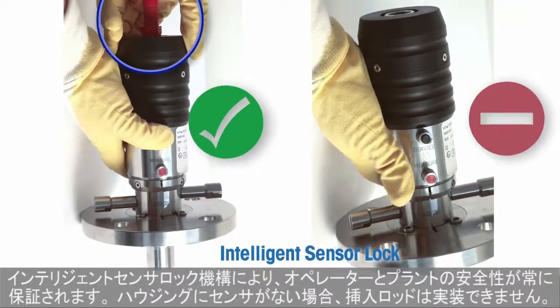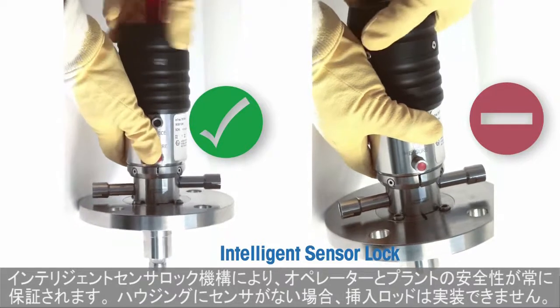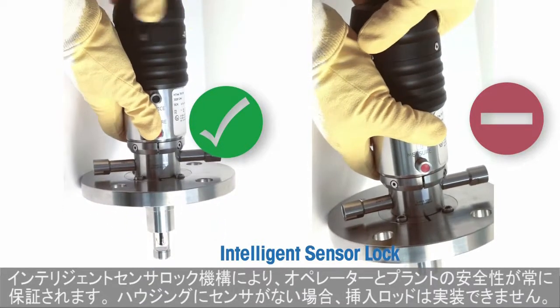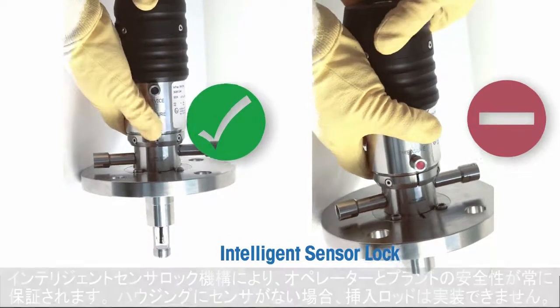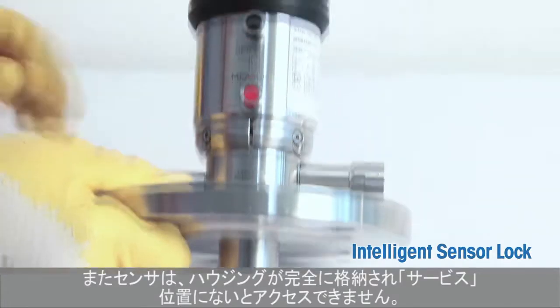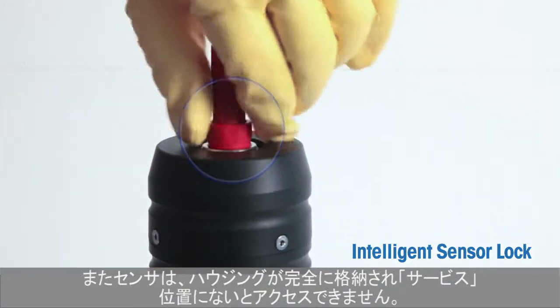An intelligent sensor locking mechanism ensures operator and plant safety at all times. If no sensor is installed in the housing, deployment of the insertion rod is not possible. And the sensor is only accessible when the housing is fully retracted in the service position.